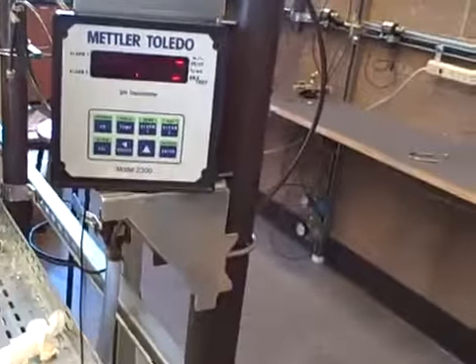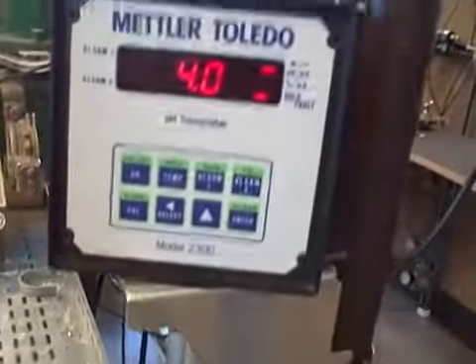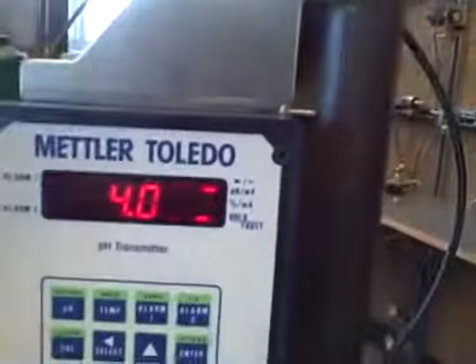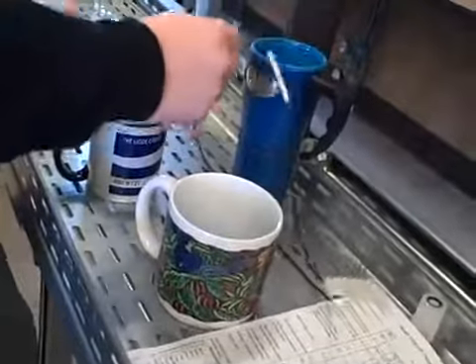Once I have it in there, I push the cal key once to tell it what pH this is. I know from these Omega buffer capsules this is supposed to be a pH of 4, and from that information I will calibrate it to that. I'll enter a 4 here and push enter. I've now calibrated my first buffer zone.